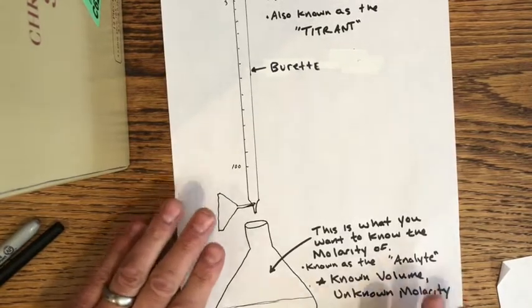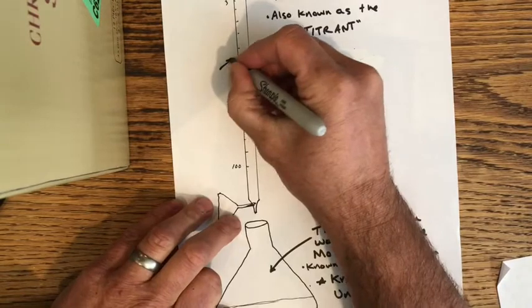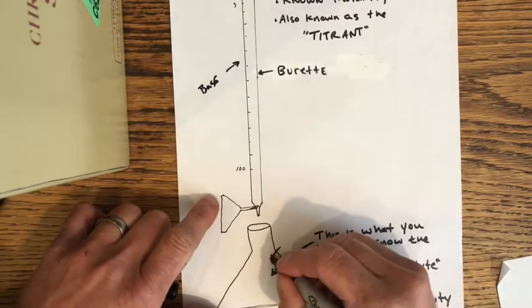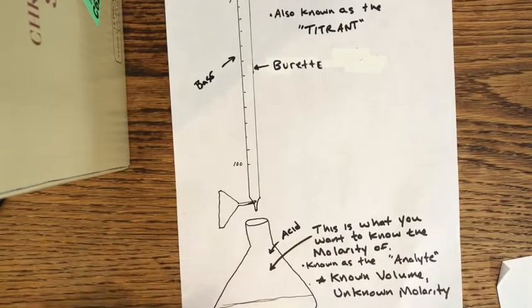And so let's just label this so we know what's what here. Let's just say that this is a base. Okay, and down here, this is an acid. And so we know quite a bit about the base.